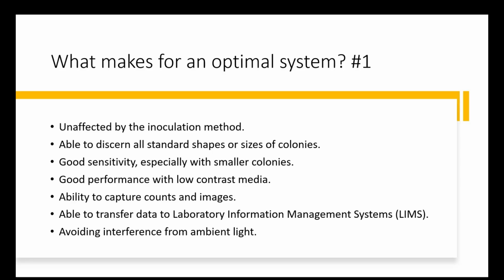We'll also need to have the ability to capture counts and images using digital technology, so we have some evidence of what was counted, and then have the ability to transfer the data, such as to a laboratory information management system. And more recent advances also have systems that can learn as they go along, taking advantage of machine learning.